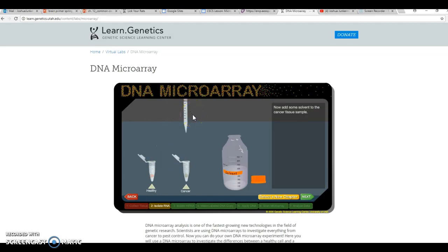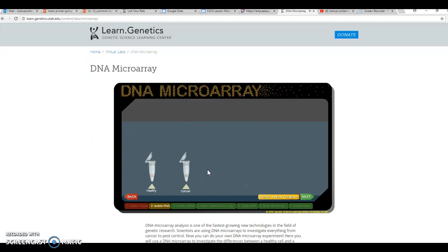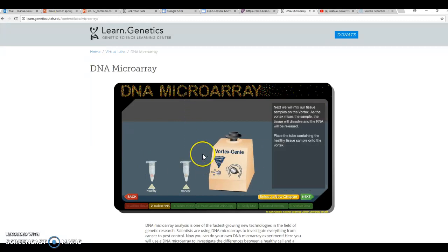Solvent is used for different things. Maybe it's protecting the cells. Maybe it's keeping them from getting destroyed. Maybe it's keeping something from happening. Maybe it's stopping molecular processes inside. I'm not sure either. We'd have to study it more. But the point is you follow the steps and realize all the technical equipment used. All right, let's click Next.